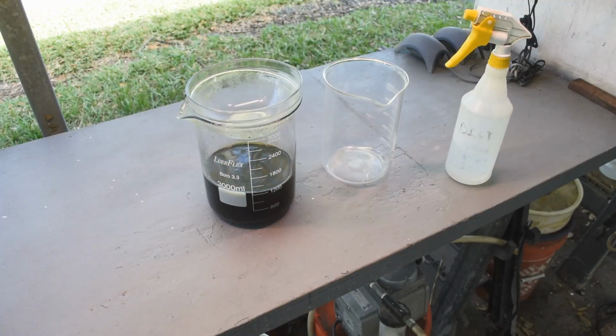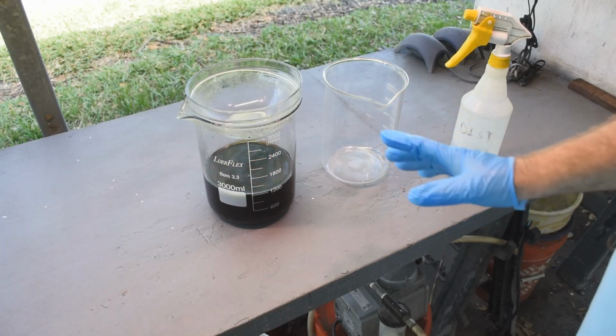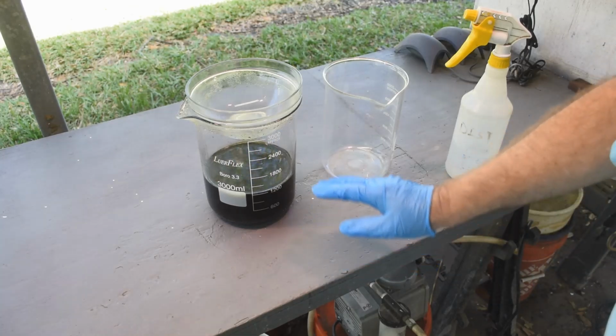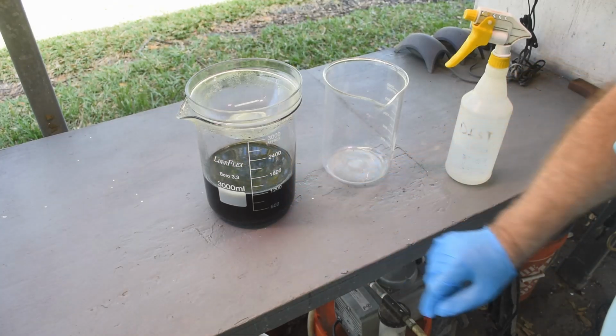All right, so it's the next day. I let this run until the end of the day and then shut it down and let it cool down. So this has had a chance to cool down. I'm going to pour off this first bunch of hydrochloric acid, and we'll give it a second treatment.